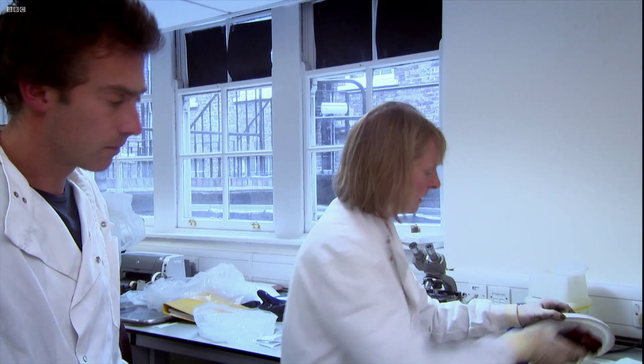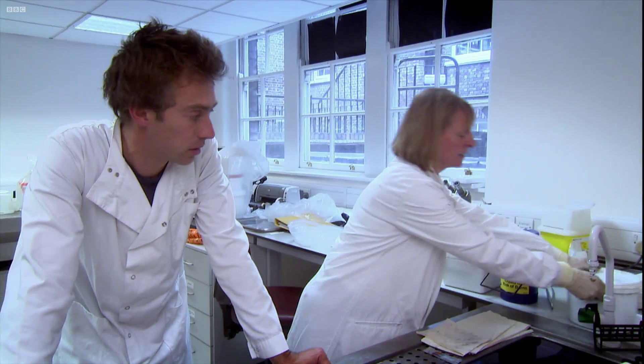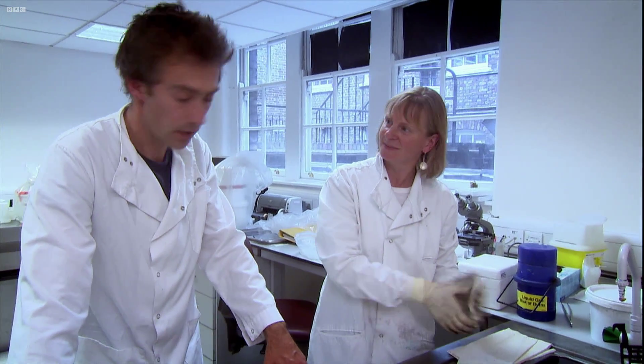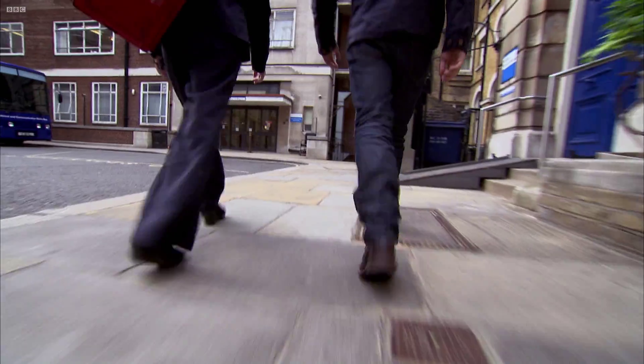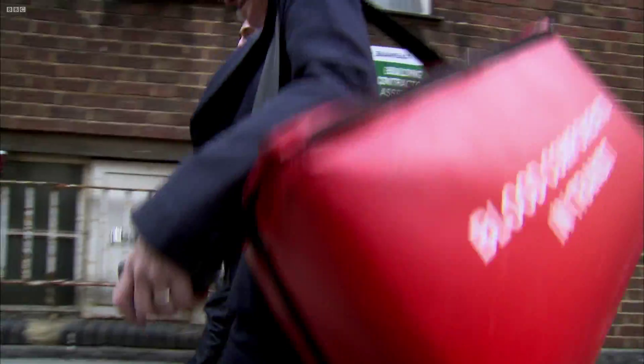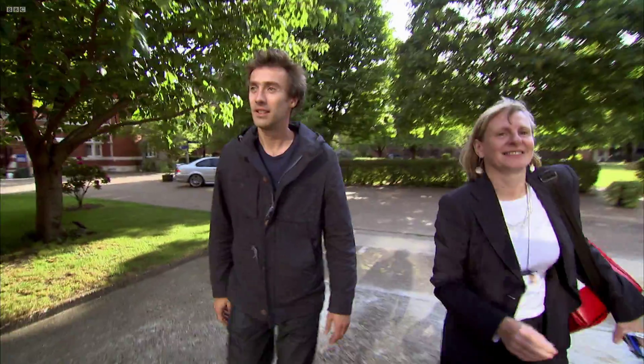At this point, the presenter begins to feel uneasy, thinking about the patient and her own sister's condition. Louise then carries the specimens to the tissue bank, which is on another site — she routinely walks samples through the streets of London to a very unassuming building simply known as the cryo shed.